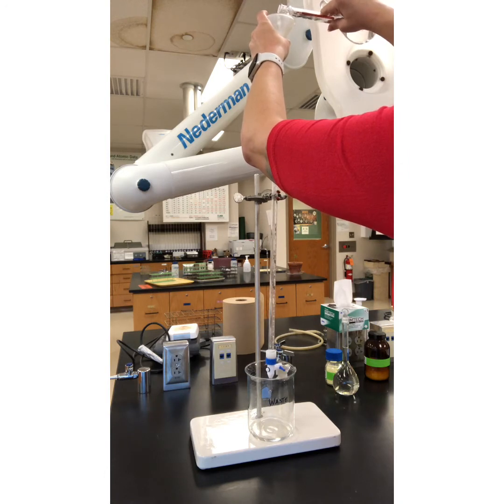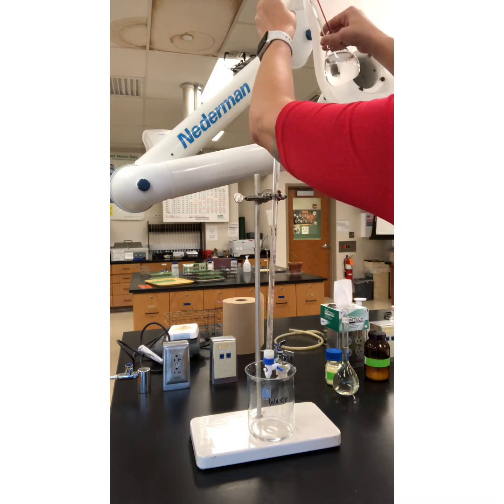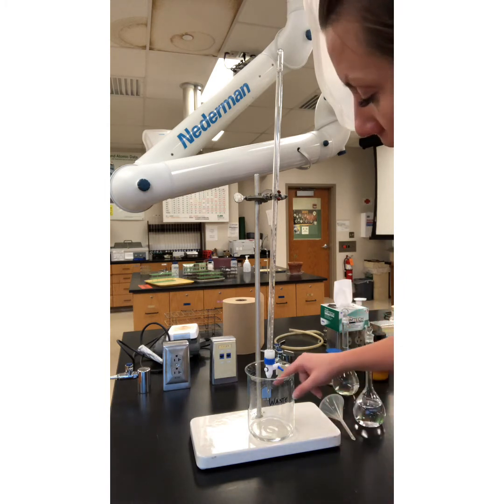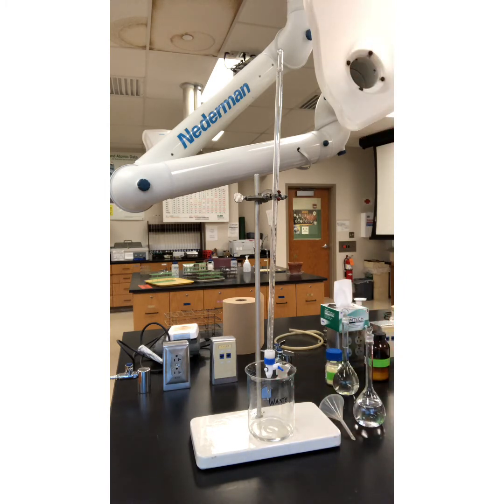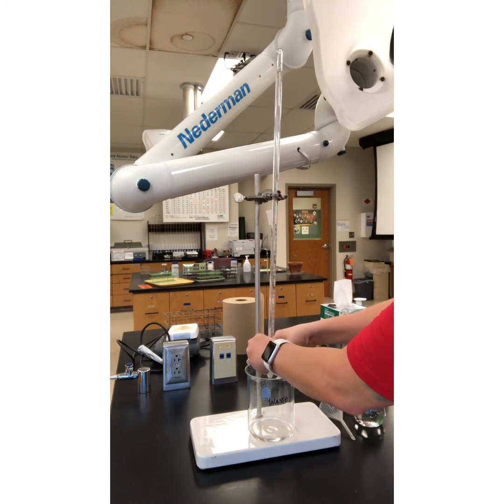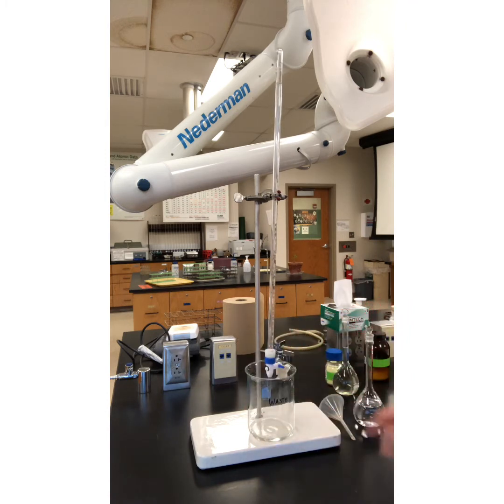Make sure your stopcock is closed. I've had students fill their burette and just run all their solution right out. Okay, so I actually overshot the top. I'm past the 0 mark, so I don't know exactly what my starting point is, but that's okay, because I've got a little air bubble in the bottom there, and I want to run that through anyway, so I'm going to let this solution come down past that 0 point, so I know exactly where my starting point is, and I get the air bubble out as well. There we go. Air bubble's gone, and I've got a starting point of my zinc sulfate solution.